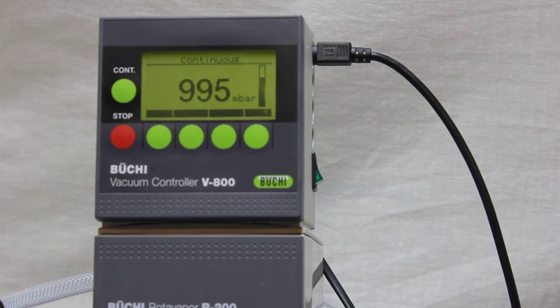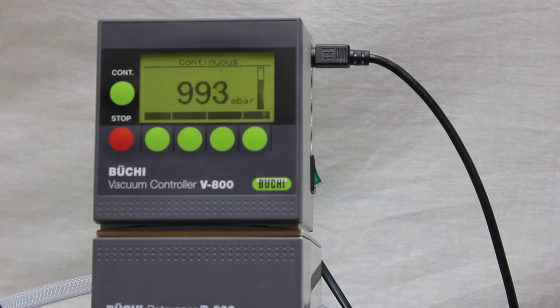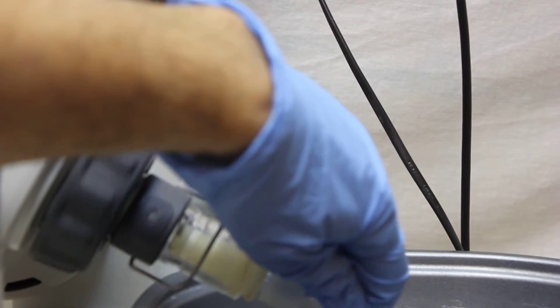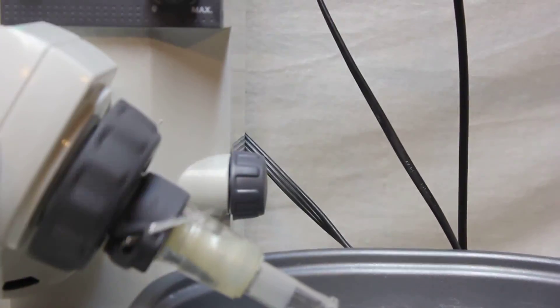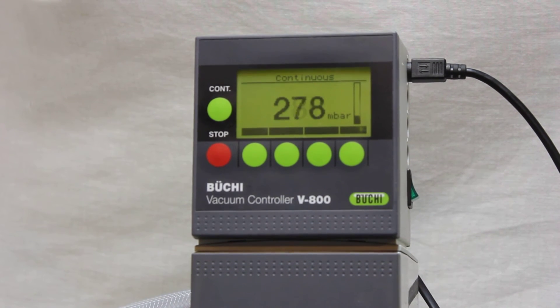When we turn on the vacuum pump, nothing is going to happen since it's missing the flask. I'm just going to use this stopper to close this area. Now immediately it starts going down.